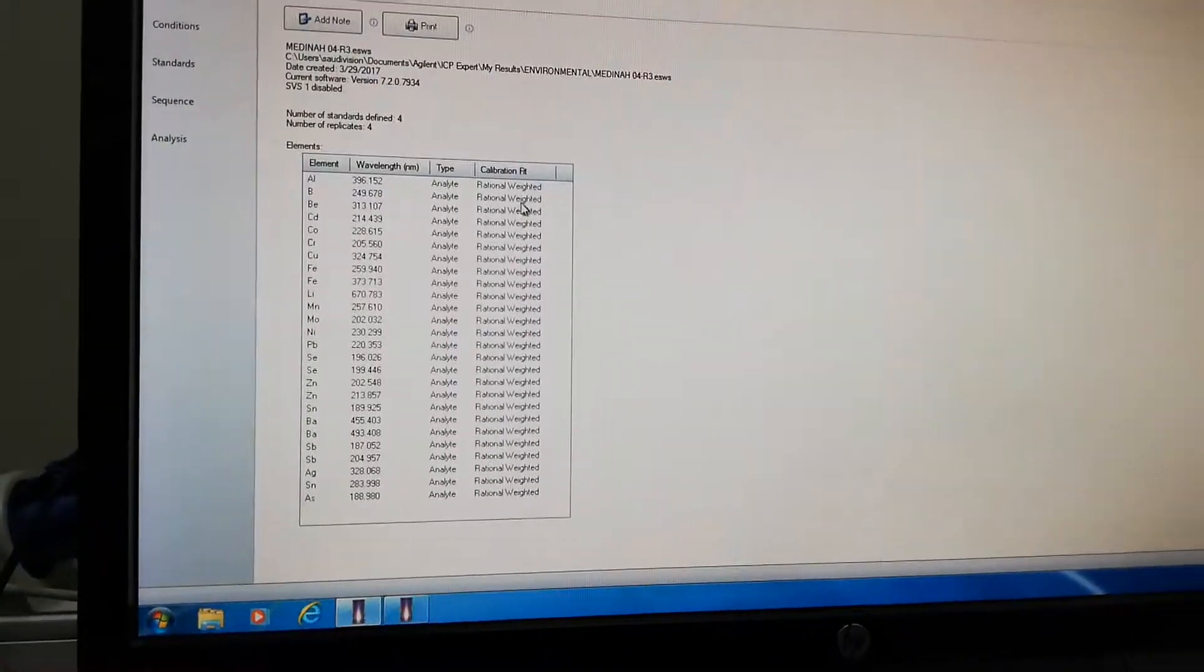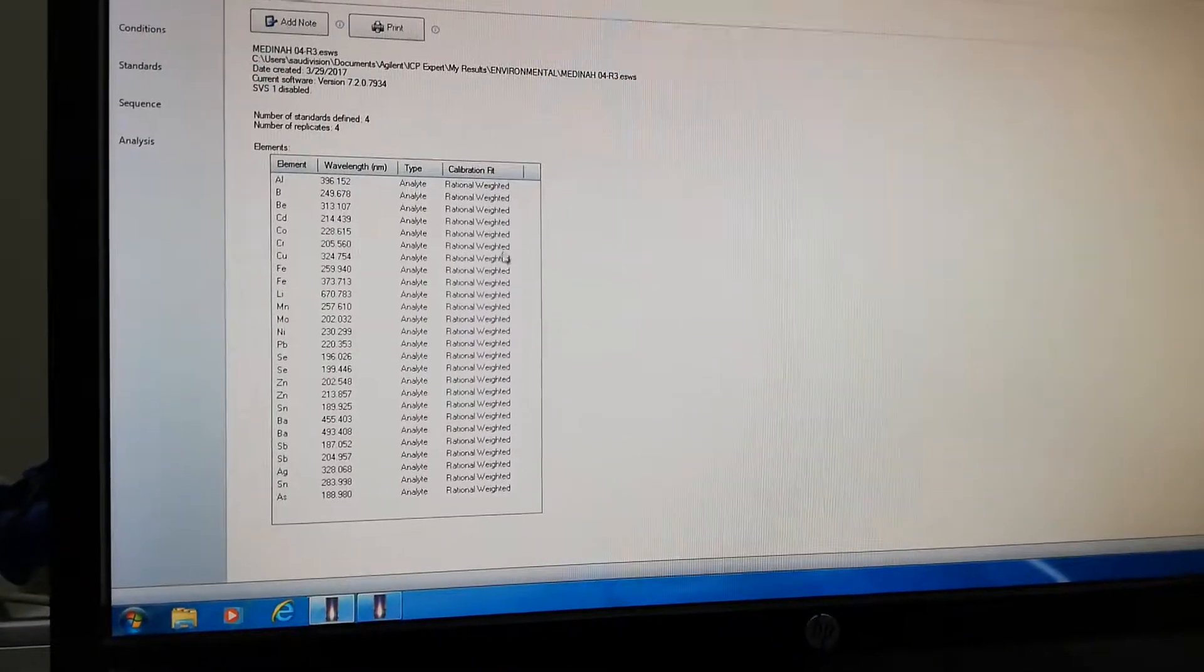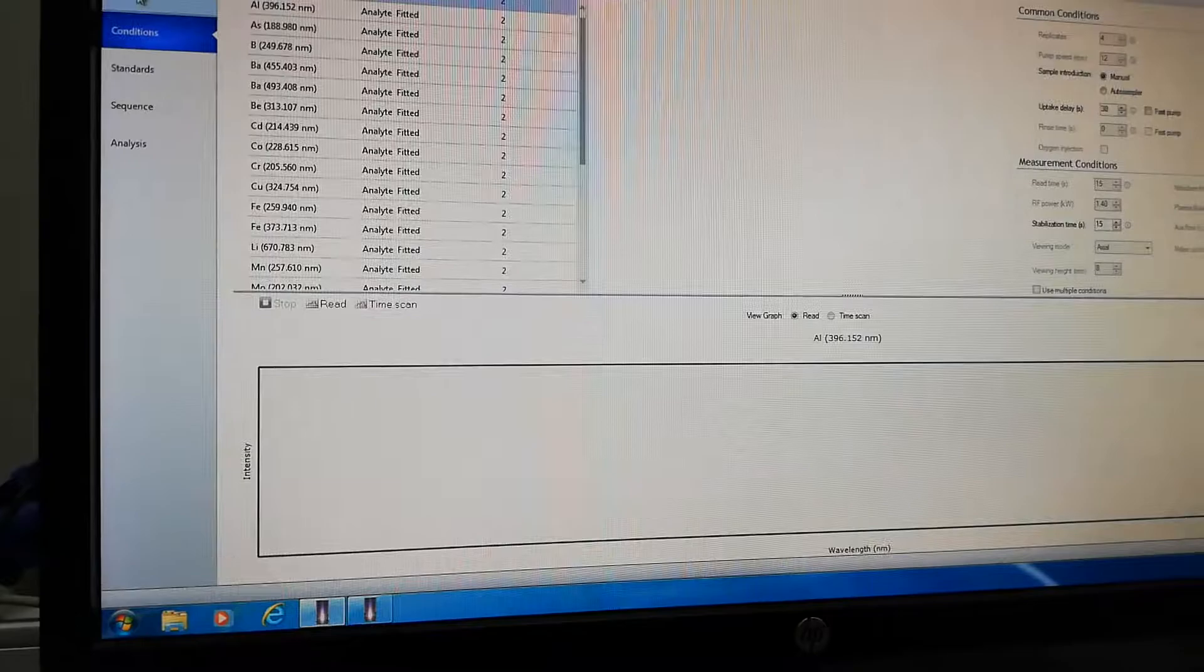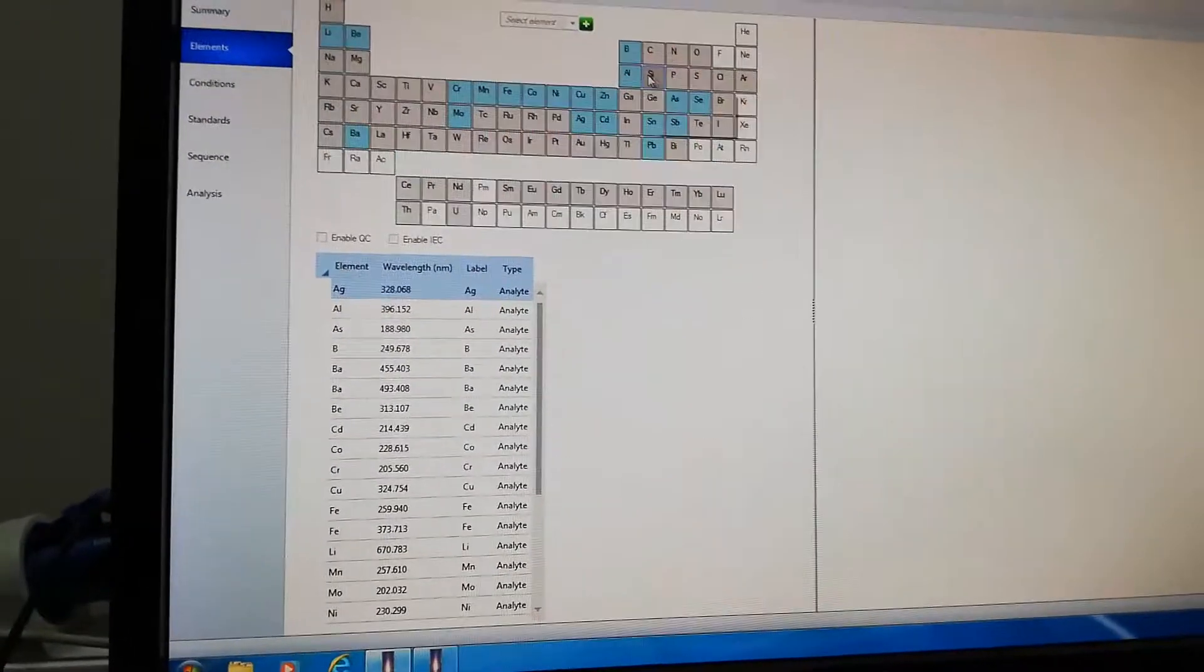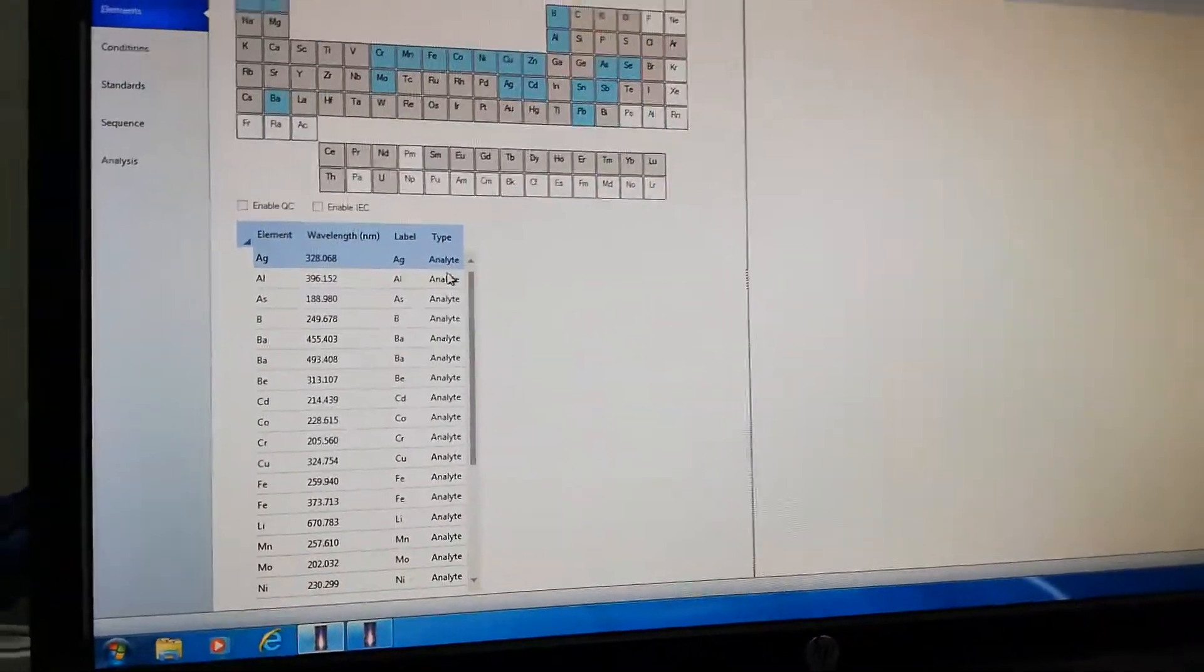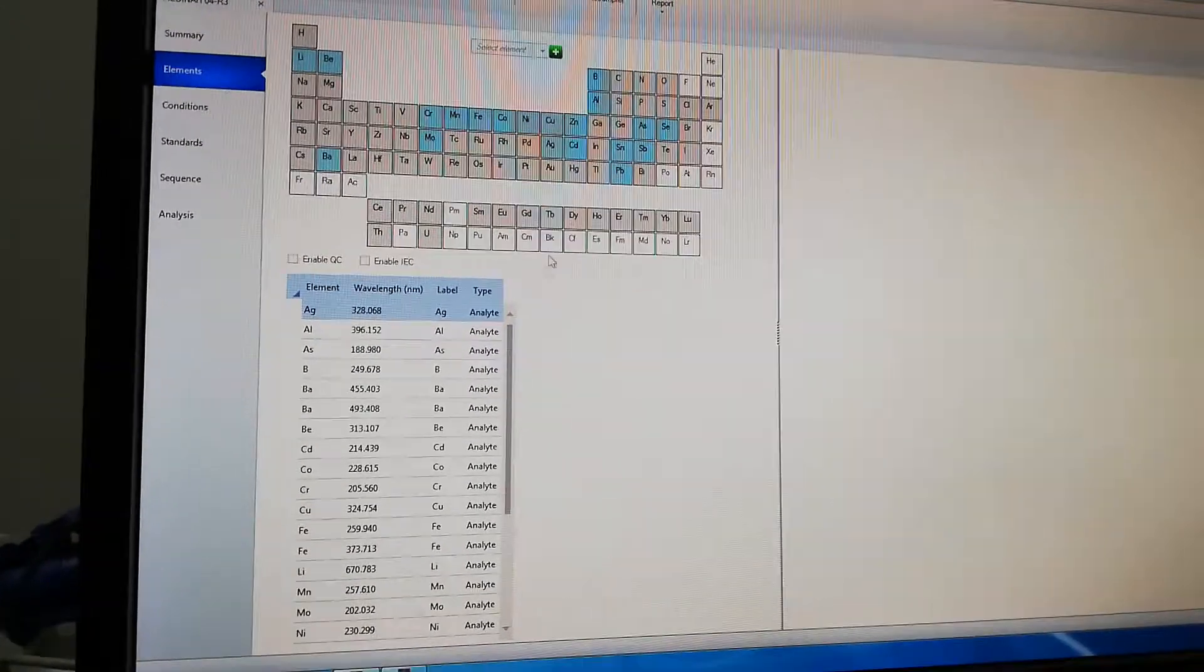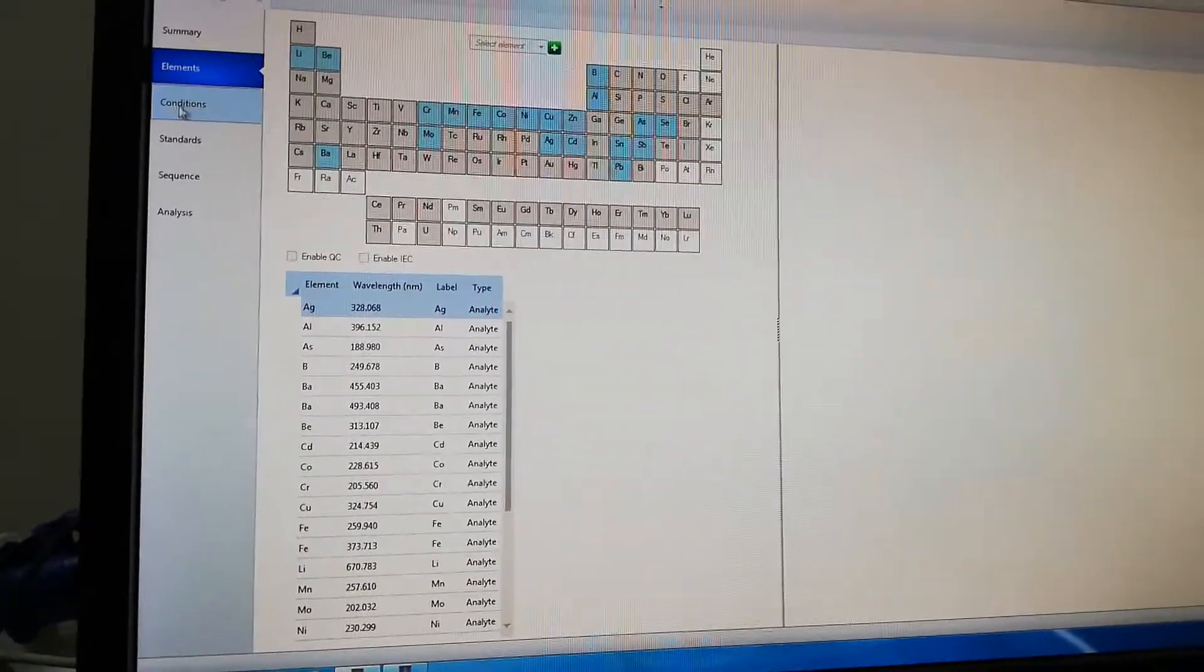What type of calibration? Linear, progression, or quadratic fit. From here you can add or delete elements from the list—selecting which elements or metals you want to analyze in the sample.